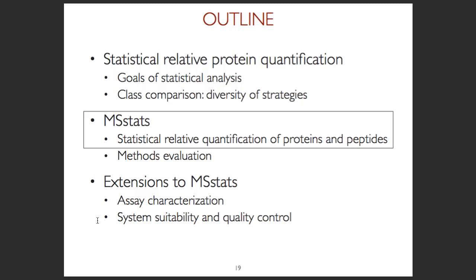What I would like to do next is to share with you the work in our group, which focuses on exactly the same question. We want to know which proteins change in abundance. So this is goal number two. It's a supervised method comparing averages between the groups. And this is a series of methods and software which our group developed for this purpose.